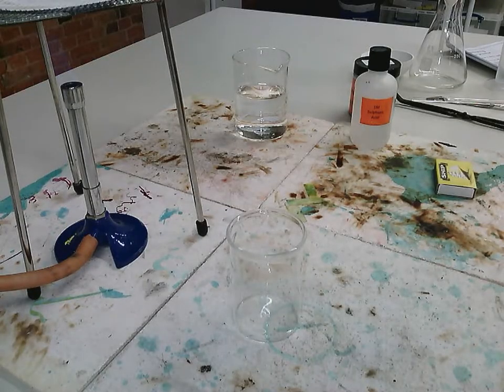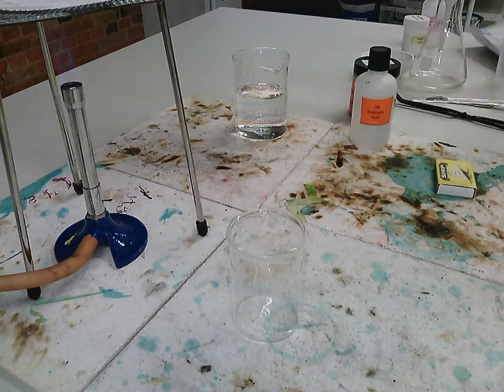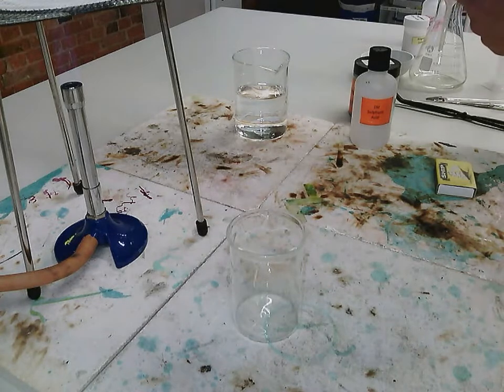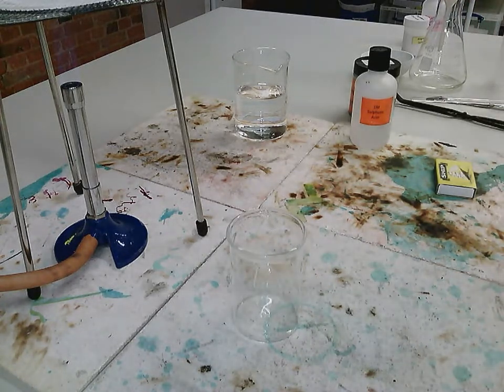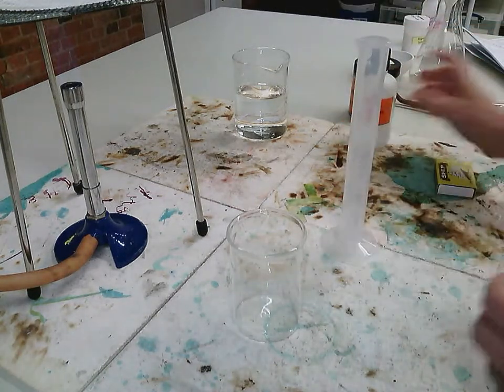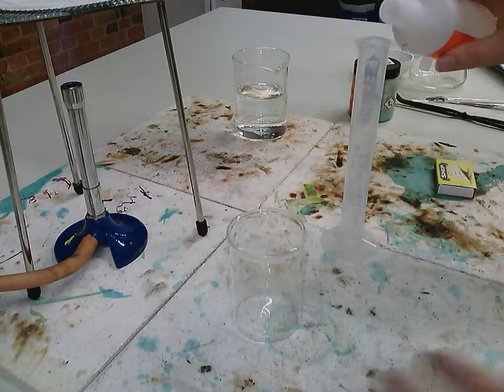Okay, the first thing I'm going to do is it's asking us to make a set volume of the acid. So what we're going to be doing is measuring out. In this case, we will measure out 15 ml of the sulfuric acid. So in your exam, you just have to write down a volume.